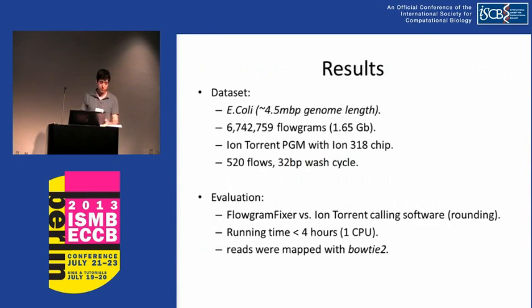All right, so we went on to checking it on real data. We downloaded this E. coli dataset from the IonTorrent webpage. It's freely available. Almost 7 million flowgrams.